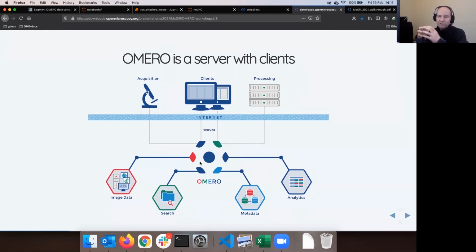The second thing is that the responsibilities of the Ome team and what is being given and shipped and what is not being given and shipped. The Ome team is developing and shipping the software called Omero server. And it's developing and shipping the software called Omero Insight and Omero Web, etc., which we then call clients, which you can and you did download yesterday. That's fine. This software is for free. Once more, also Omero server is a software, okay?